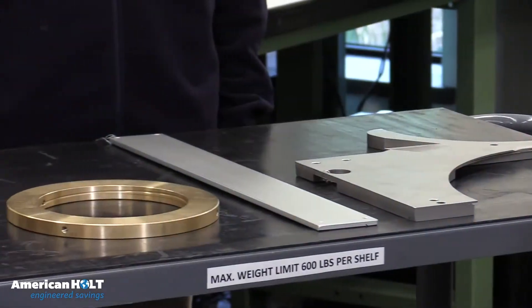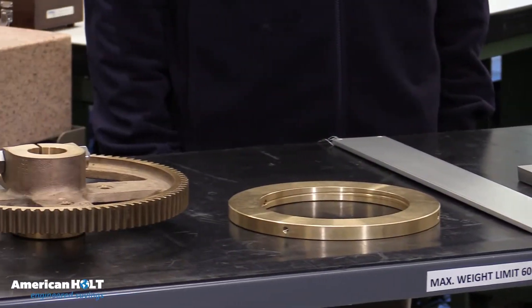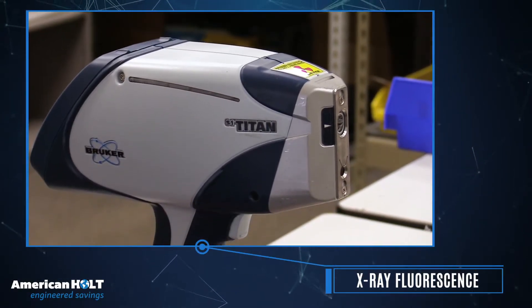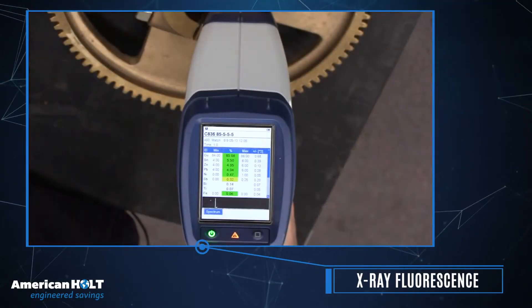The most common parts we reproduce are made of metal. For these, we utilize X-ray fluorescence technology, or XRF, to obtain precise material readings.